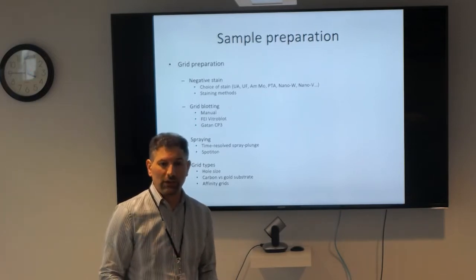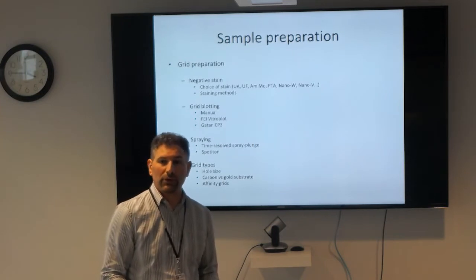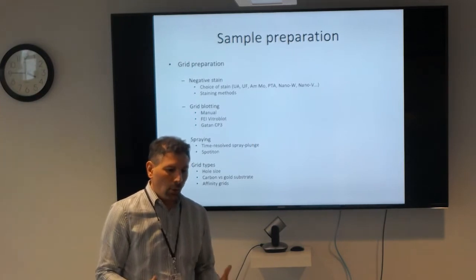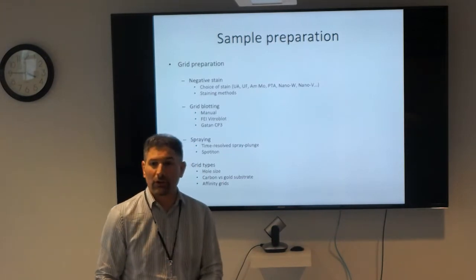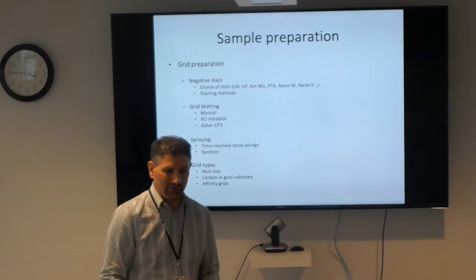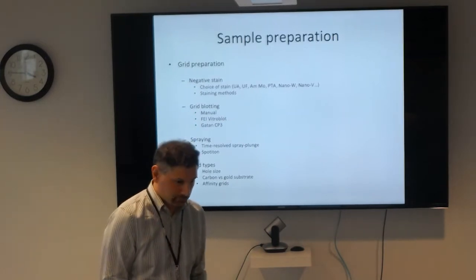You want to see good 2D class averages and try to at least get into 3D, get some sort of a 3D reconstruction. This gives you an idea of what you start out with, and is it actually freezing that's starting to cause some problems? Or do my particles just look mediocre to begin with, okay?